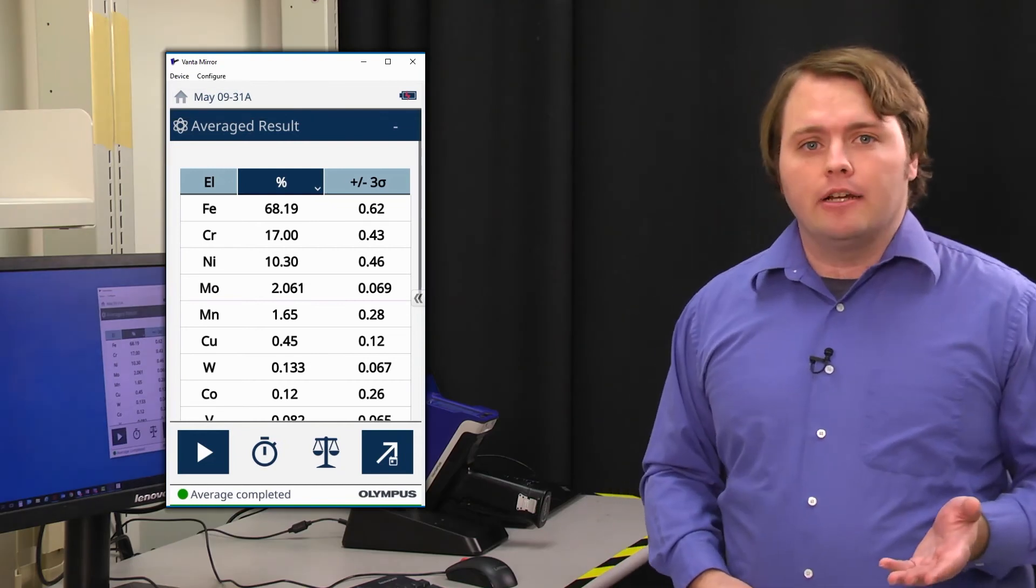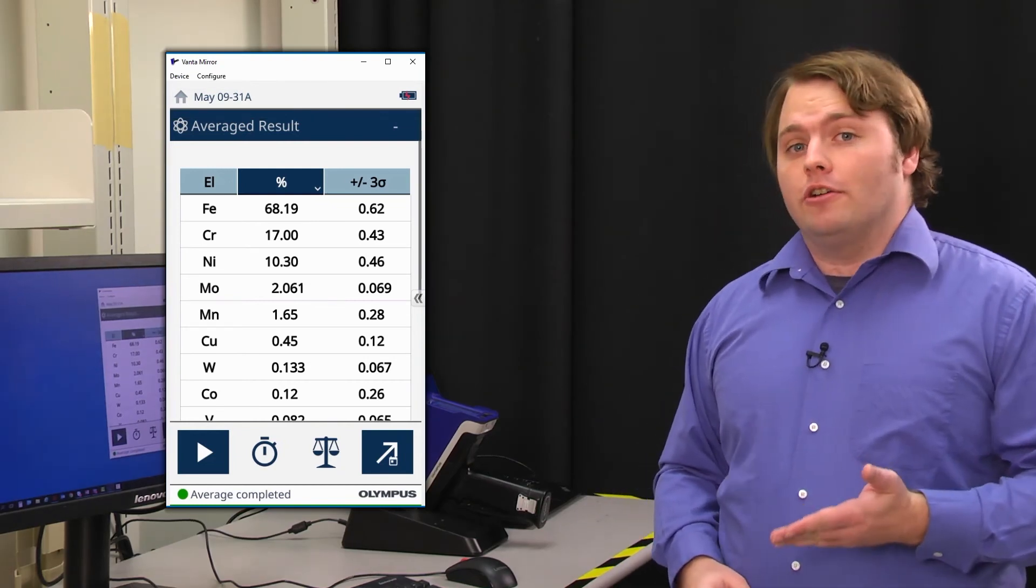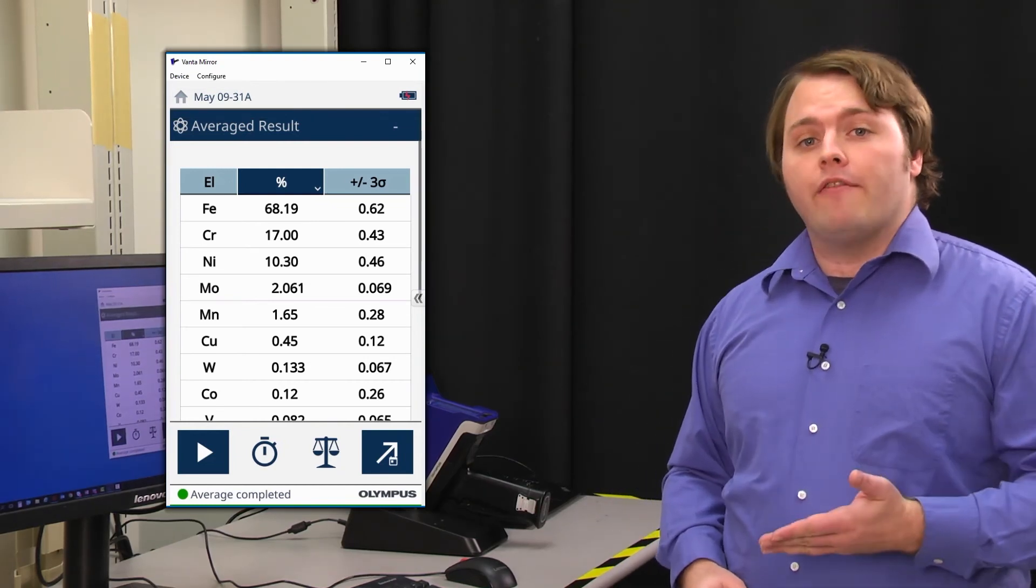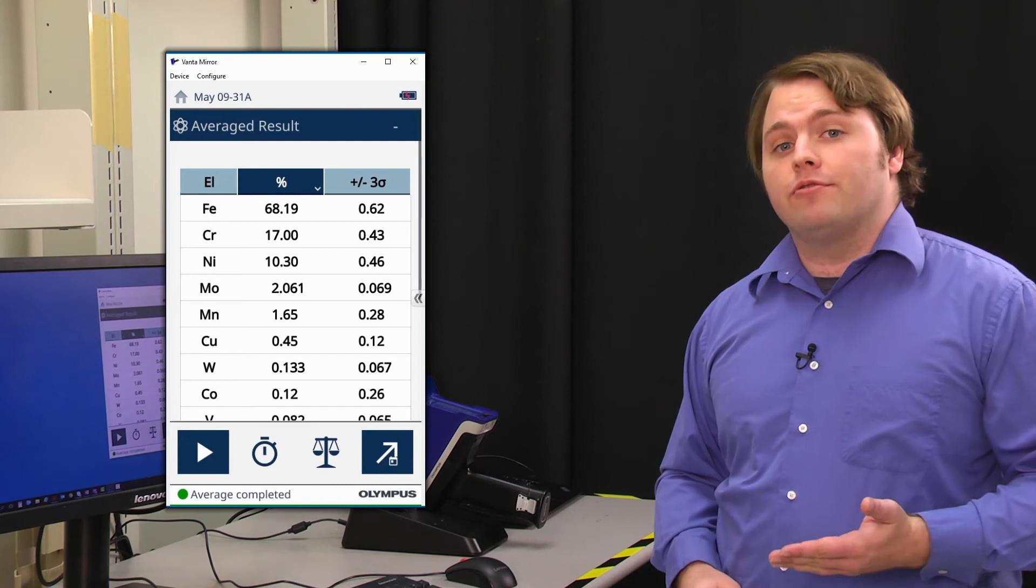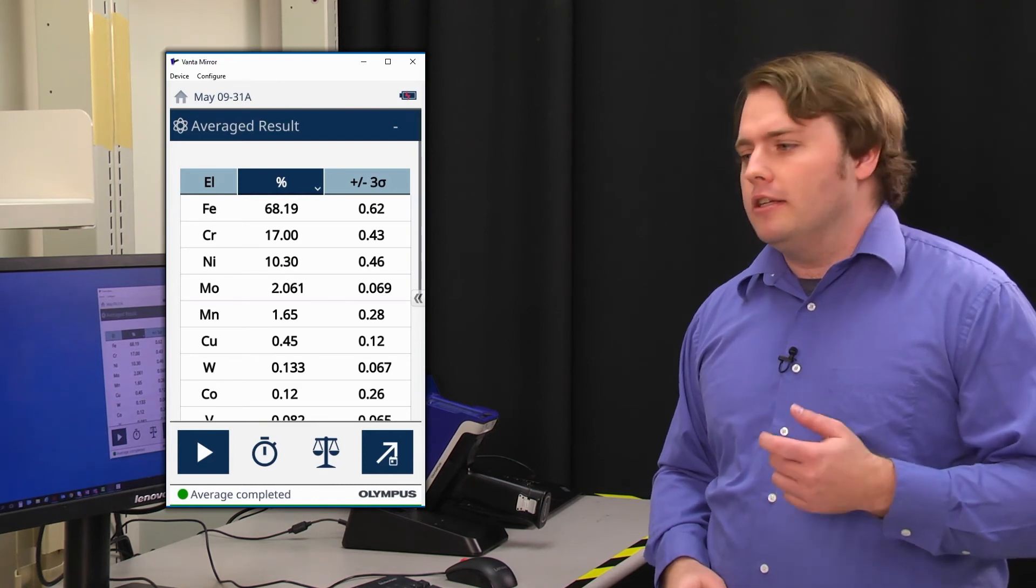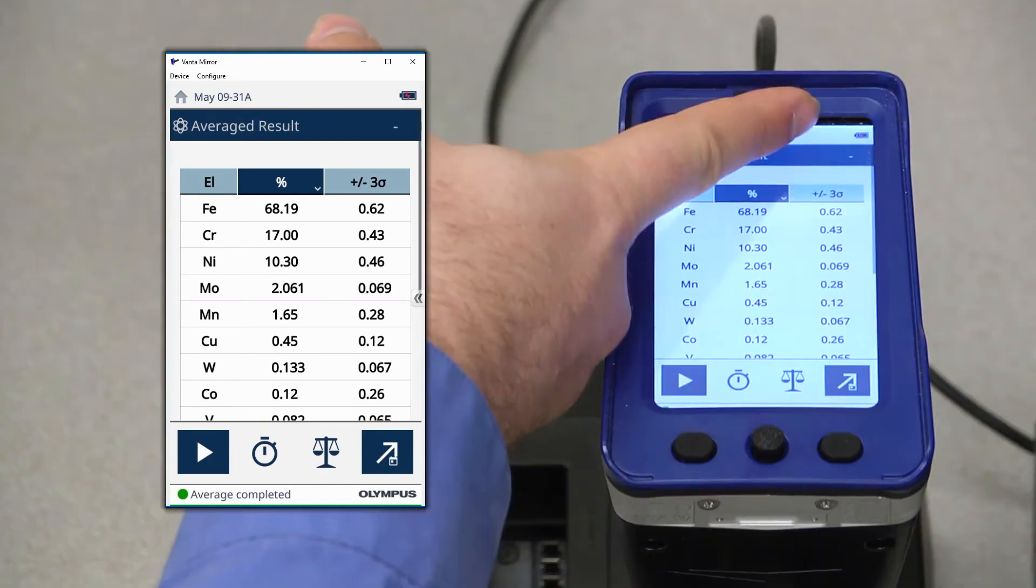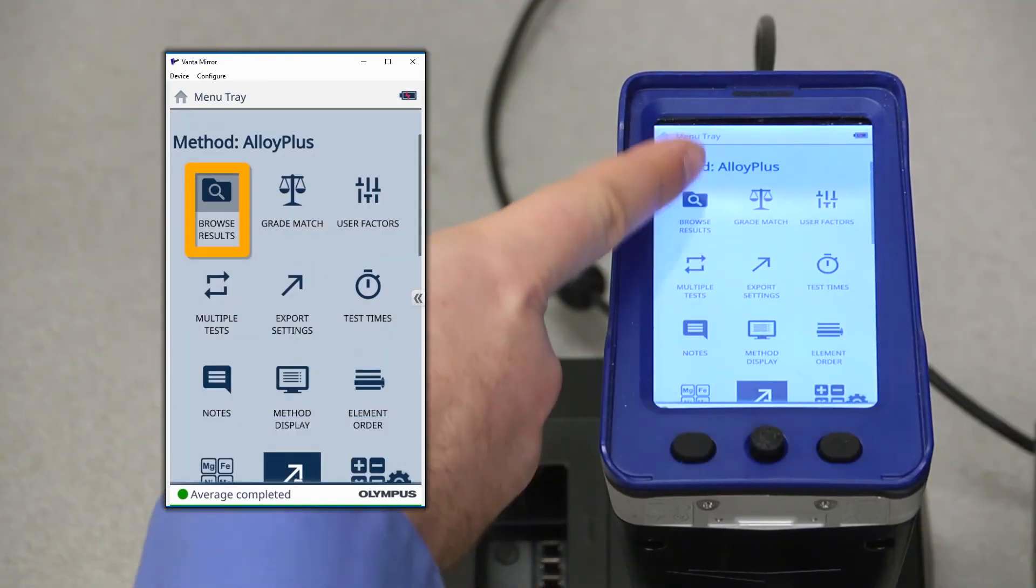So that's live averaging. In addition to that, you can also generate a historic average from previous test results. To do that, we'll need to go to the Browse Results feature in the drop down menu.